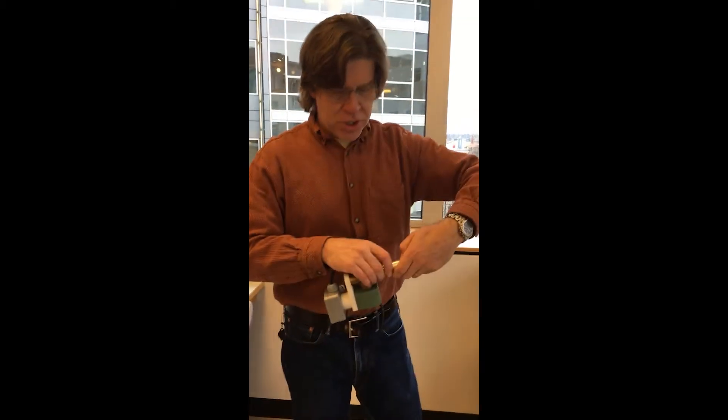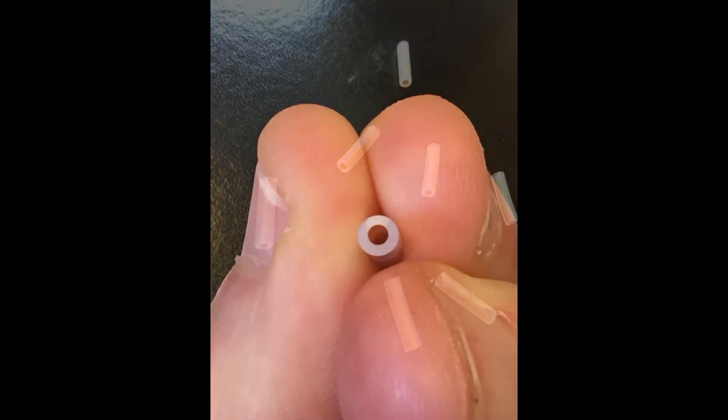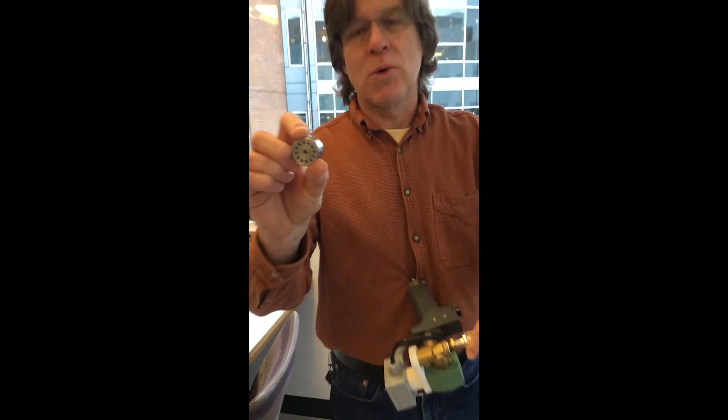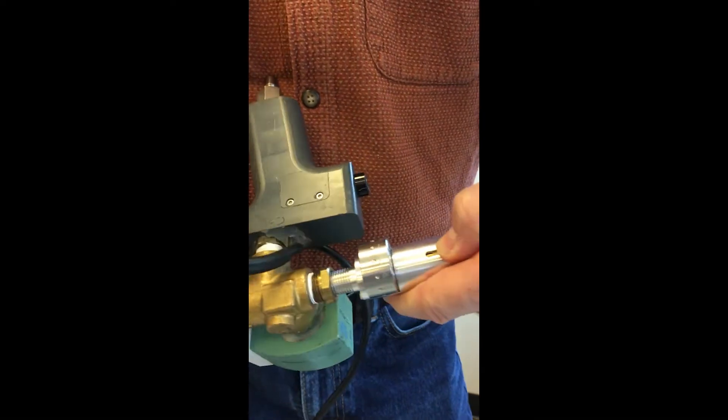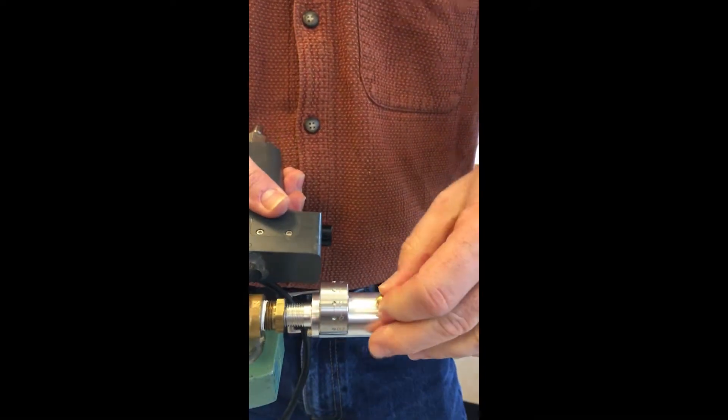You take those little cartridges that you have a picture of over there, you slip them in here — you can hold 12 of them in there — and that goes into the gun here. It's like a 12-shot revolver.